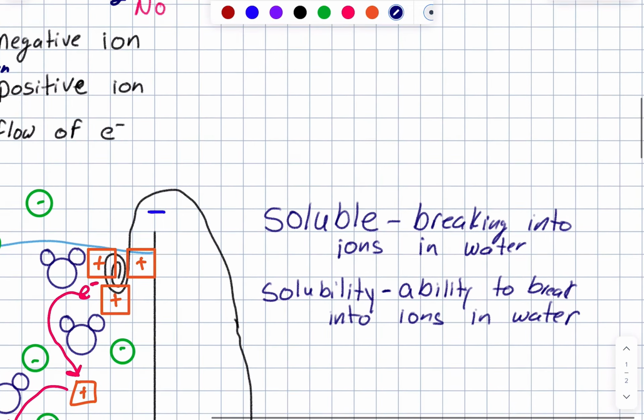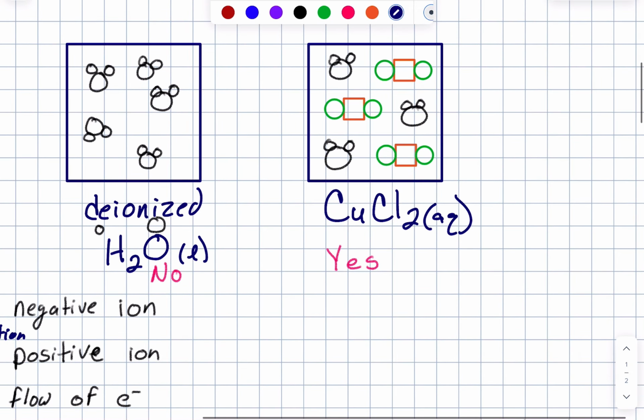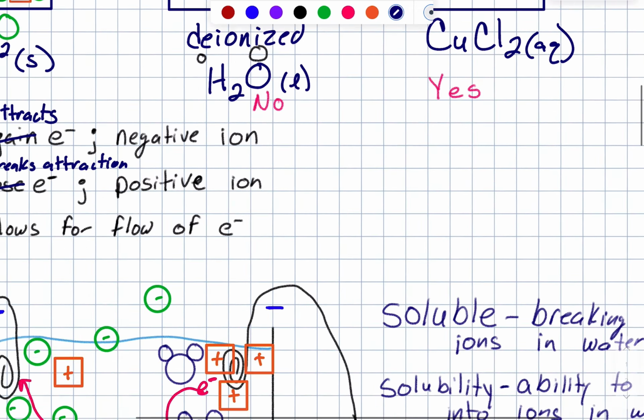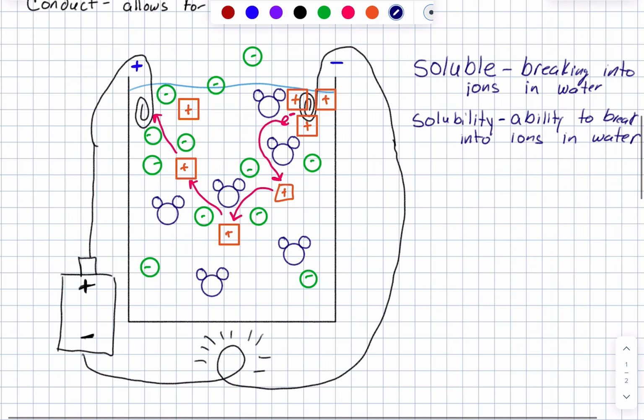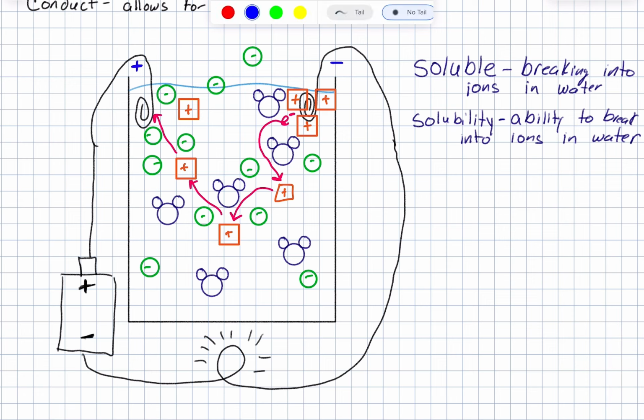And so, when we look at this, this tells us that our compounds together, when mixed together, they broke apart into their ions, and we knew this because in the observations we made, we saw that my negatively charged side of the wire connected to my battery, so I followed that, it lit the light, and that negative side had a lot of brown particles that had some shiny flecks in it that lined my paper clip. And so we realized that that was the copper. So copper was lining the negative, telling us that it had a positive charge because opposites attract.